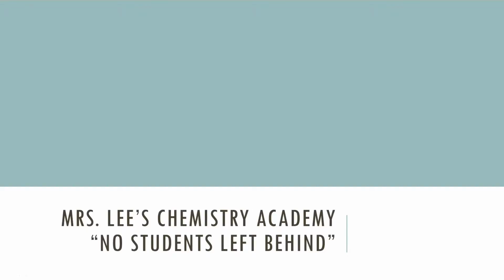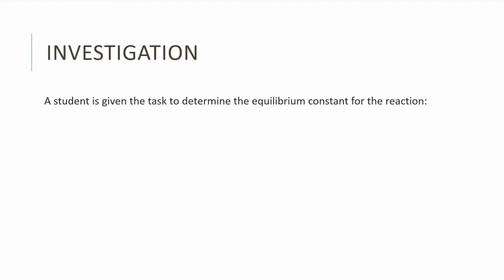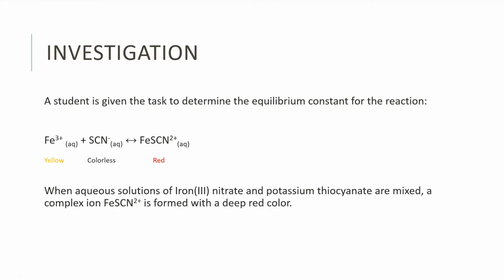Miss Lee's Chemistry Academy, Lab 9, Determination of an Equilibrium Constant. Investigation. A student is given the task to determine the equilibrium constant for the reaction shown below. When aqueous solutions of iron(III) nitrate and potassium thiocyanate are mixed, a complex ion is formed with a deep red color.